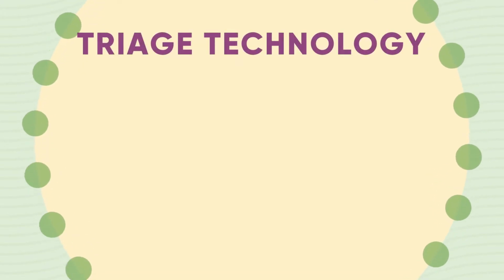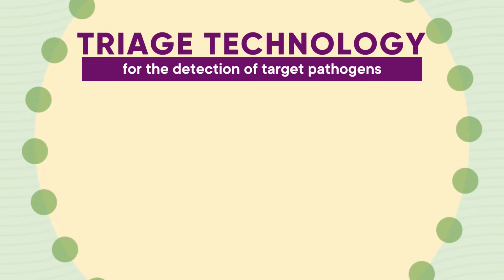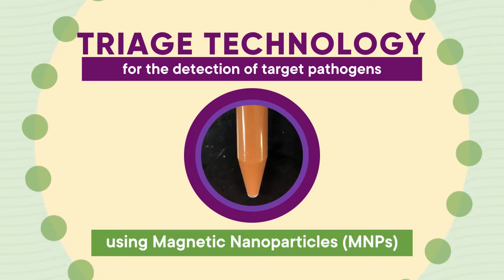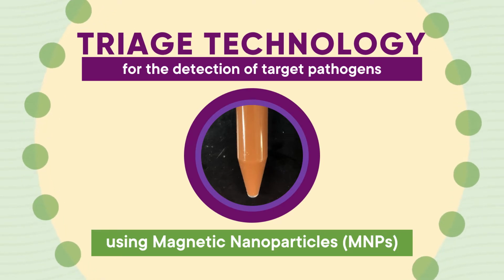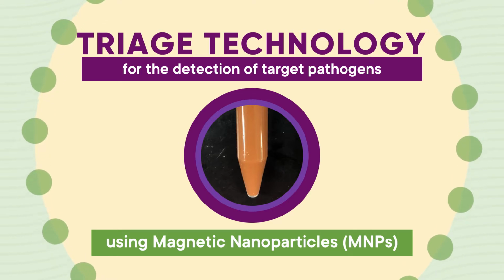Triage technology can be used to rapidly screen the presence or absence of a specific target in a sample. This process will be done using the magnetic nanoparticles, or MNPs, developed by Dr. Evangeline Alocilja of the Nanobiosensors Laboratory at Michigan State University.